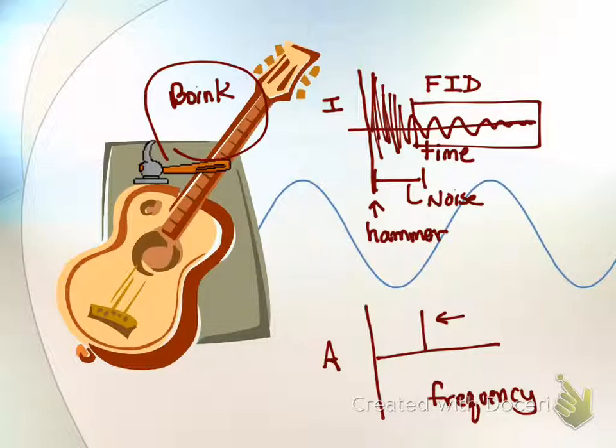So yeah, it's called an equalizer. Anyways, it takes time-based data, that's the sounds you're hearing recorded in real time, and converts it to frequency-based data. Essentially, it's doing a Fourier transform on the fly. Okay, so what we're going to do then, just to make this clear, is take a molecule, and a molecule is going to be a lot more complicated than a guitar with one string. It's going to be a guitar with many, many strings. In essence, if we're doing hydrogen NMR, one string for every hydrogen on the structure. And we're going to whack it with energy, and the molecule is going to freak out.